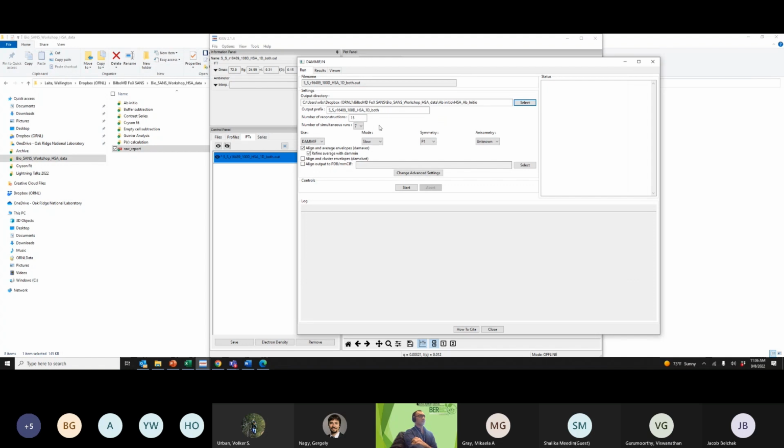So here you tell the number of reconstructions you are running. You can run in parallel different numbers of reconstructions, but in my experience in RAW it's a little bit time consuming to run them here. I prefer using ATSAS directly to do that.